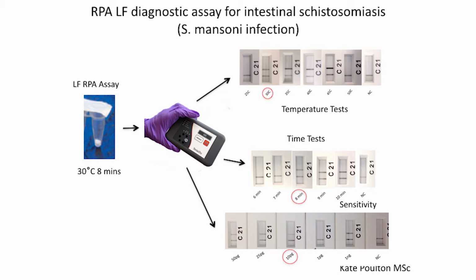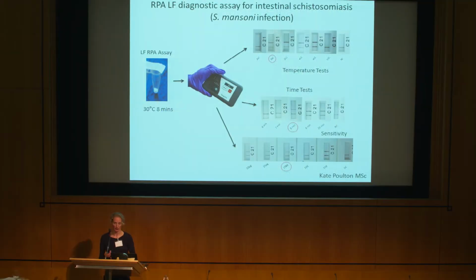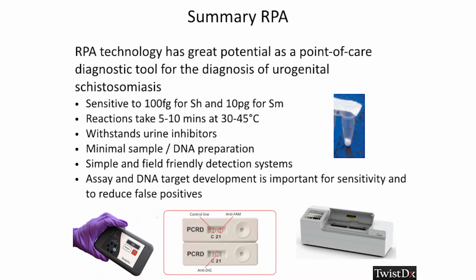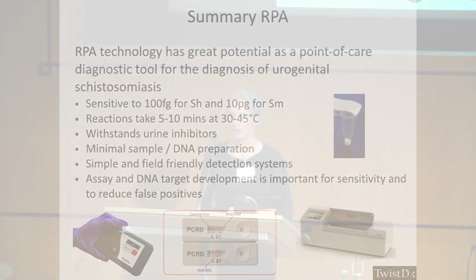Sensitivity isn't quite as good as we'd like. We're only getting down to 10 picograms, but again, with further development, we can hopefully improve that. So again, huge potential for that. So just a summary on RPA. It really does seem like it's a very good potential assay for point-of-care diagnostic tools.